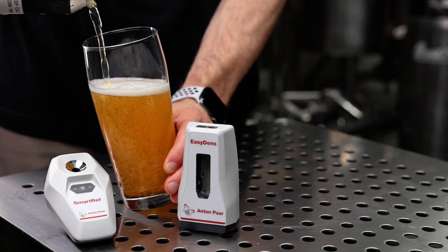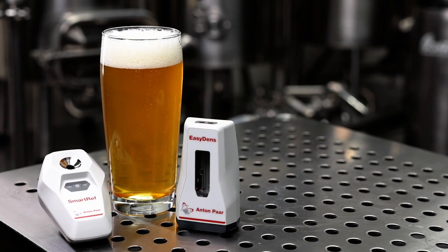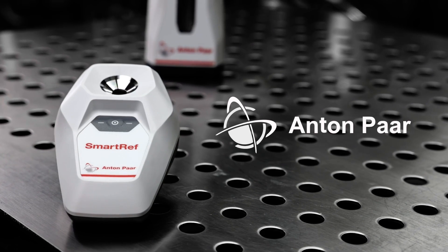Measuring the alcohol content of homebrew beer can now be done with a high level of accuracy. Meet the SmartRef Digital Refractometer from Anton Paar.